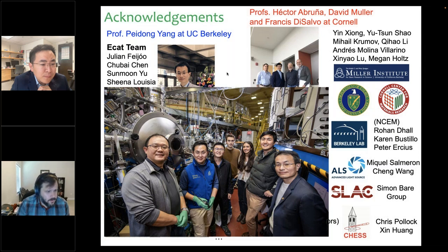Move down to another question. Can you explain more on how you minimized X-ray and beam effects on the copper particles in order to minimize oxidation?